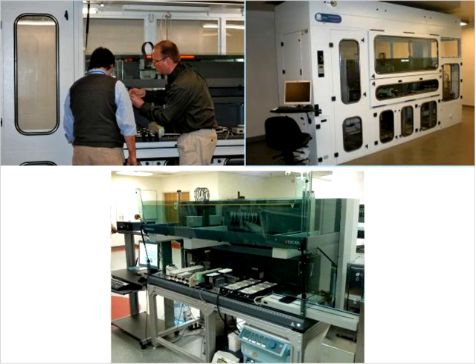To be able to work with BSL-3 agents in the facility and to minimize potential for exposure and aerosolization, we have now, if you look at the top two pictures, within our facility, once we moved it here, placed that entire automated system within what's basically a biosafety cabinet or a biocell that provides containment of the automation. So that gives us a dual level of protection.